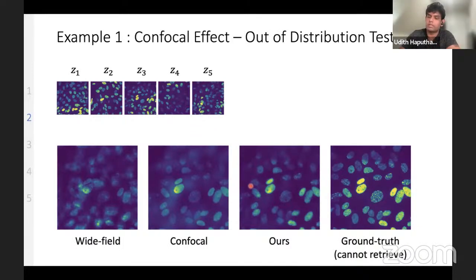Okay, yeah, that makes sense. So what you mean is, on top of the pinhole, we can add some other features to make it better. I don't think you can make the pinhole better. The pinhole has been there for a long time, like 50 years or more, so it's almost probably the only route.